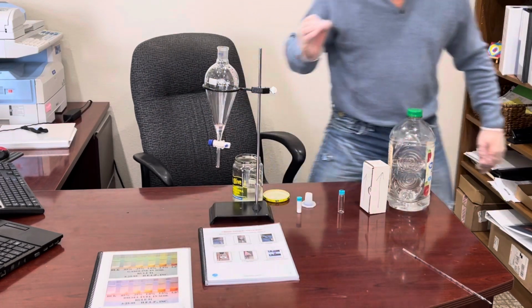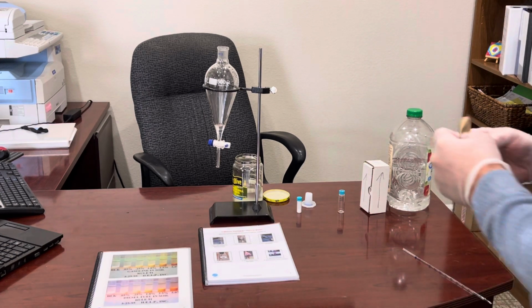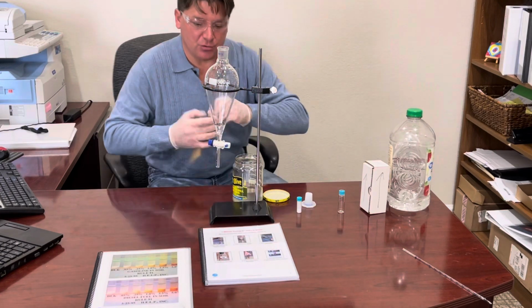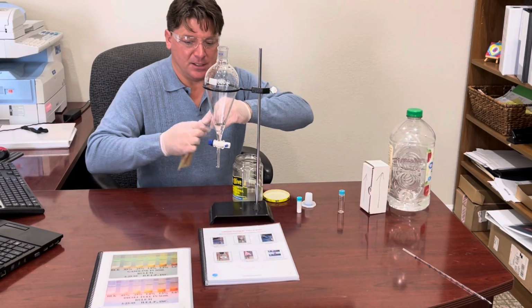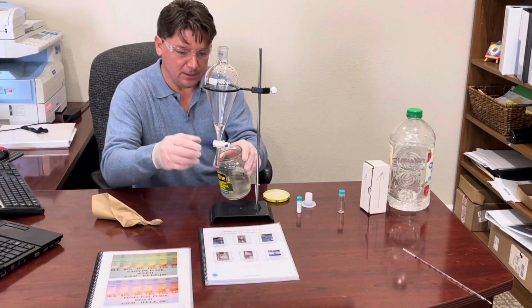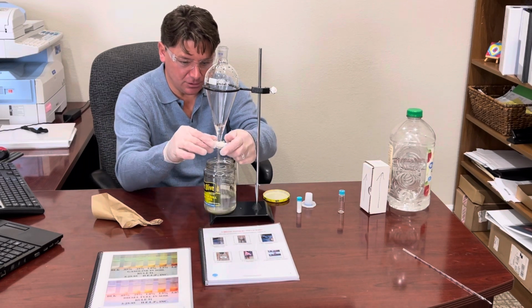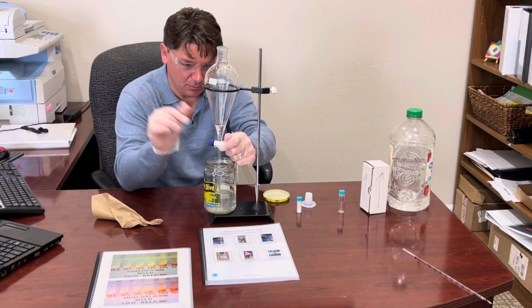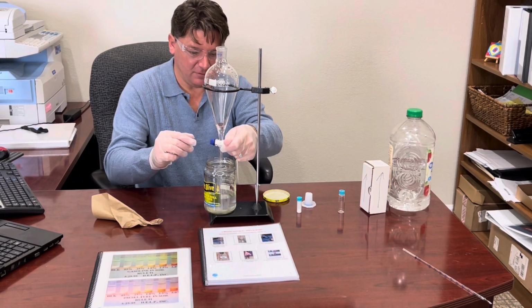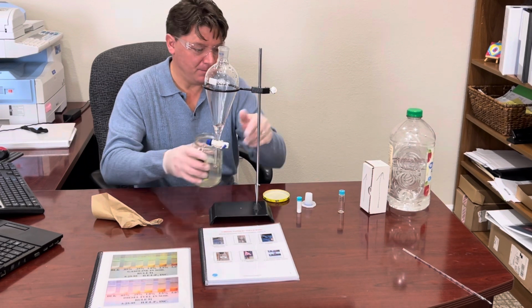Now, that being the case, I let a little bit of solvent come through to help clean out this stem, but just to make sure, we are going to take a little piece of paper towel here and make sure that stem is dry, because we want to make sure we don't have any water. As we release this solvent into our test tube, in fact, we're going to release just a tad bit more, because we know we've got 10 mils of solvent in there, and we only need 4.2 mils of it, so we're going to release a tad bit more, just to make sure we see solvent come through to help us make sure there's no water in that stem.